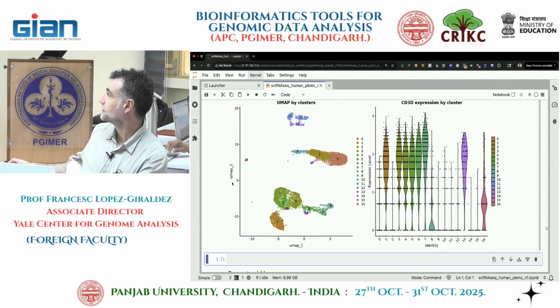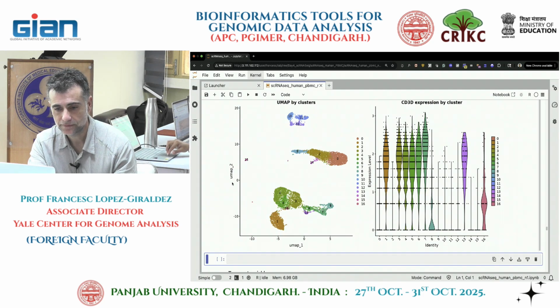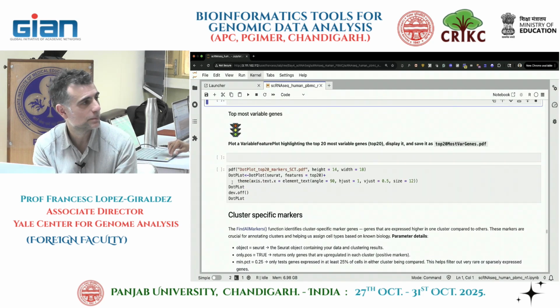Maybe the density plot is going to be the most helpful thing. So these clusters should be here. Where is cluster 2? Oh, it's up here. So cluster 2 is not expressing it. Cluster 0 is not expressing it. And of the group down here, the only one that doesn't express much CD3D is 8. 13 is expressing, oh, 13 is here. Okay, good. So 16 is here. Yep.